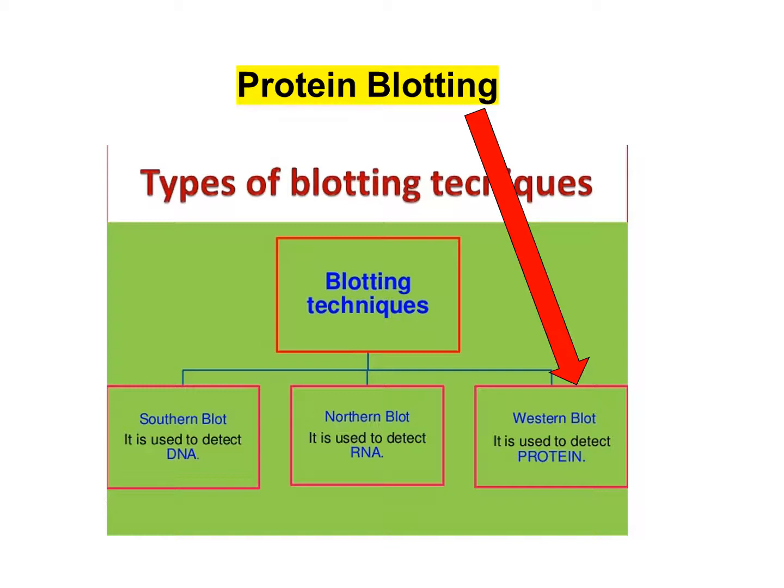And then in cell biology, we do a lot of Western blotting, and that's dealing with proteins. So protein blotting, Western blots, are the world we live in here, trying to figure out function and location. DNA and messenger RNA will be more in the cell biology course I teach.